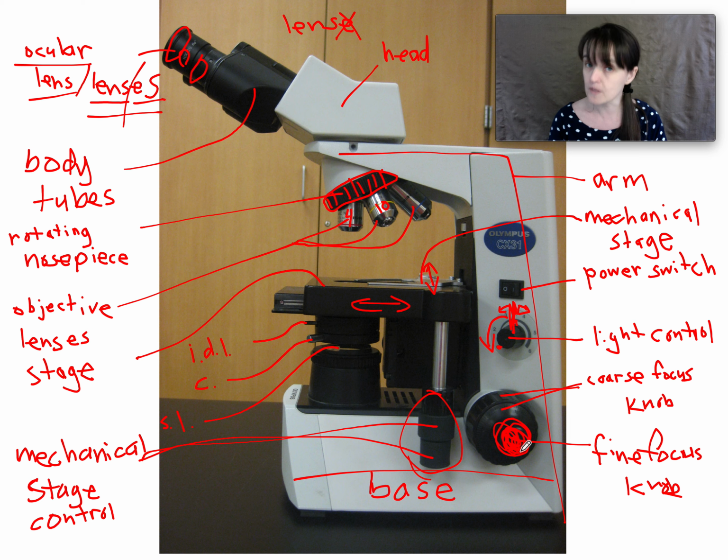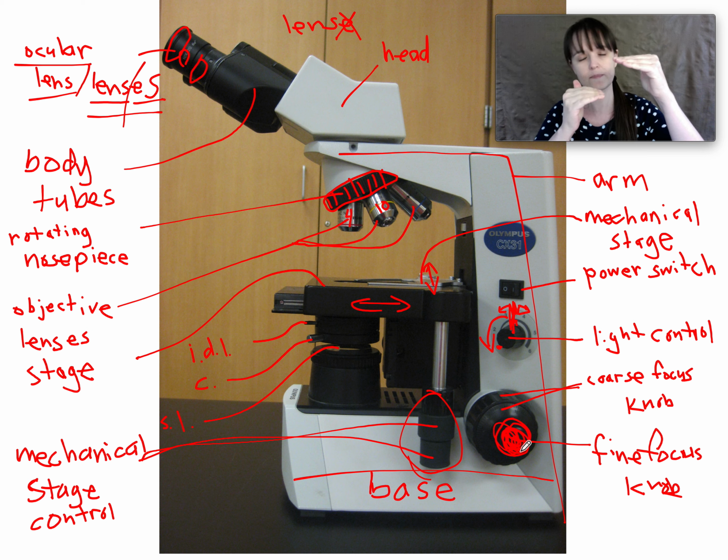And there's a reason why we don't start with it all the way up. Because especially with some of these slides, depending on how the microscope is set, I saw my husband out the window. He's about to use the weed eater. So if you can hear that starting up, I apologize. We're making the video though.